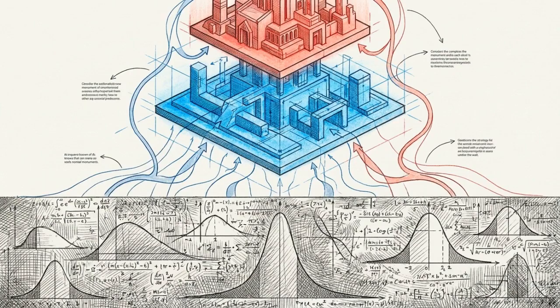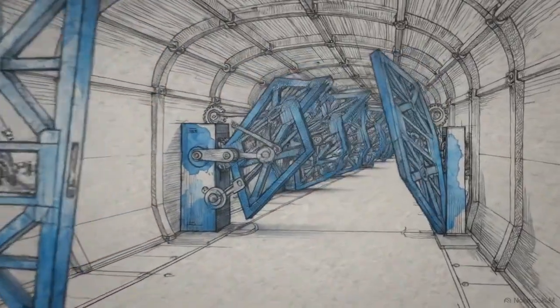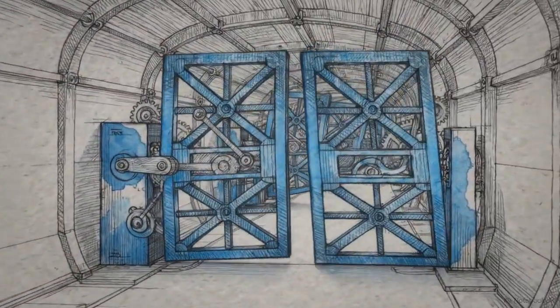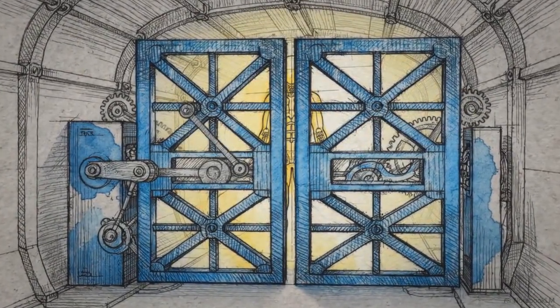Validating raw sequencing reads for a clinical diagnosis requires mathematical proof at every single layer of this hierarchy. Memorizing terminology is insufficient. An analyst must understand how these metrics operate as sequential gates, filtering out digital noise to protect the final patient outcome.